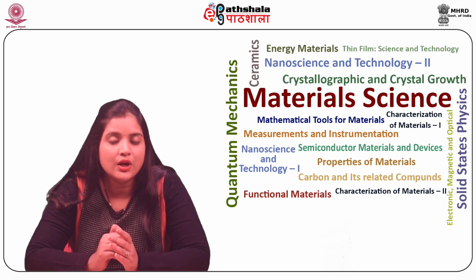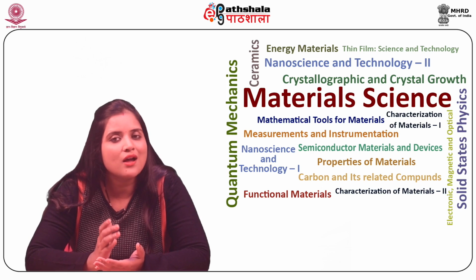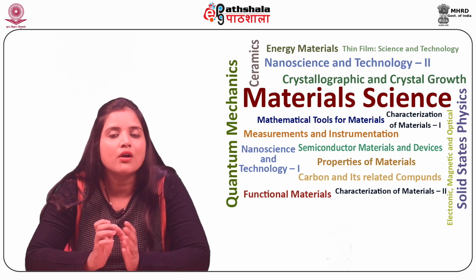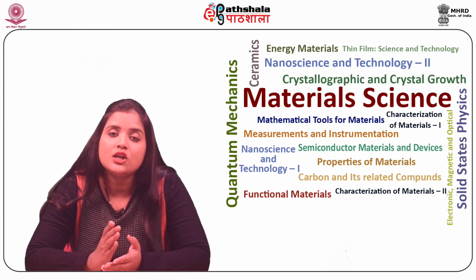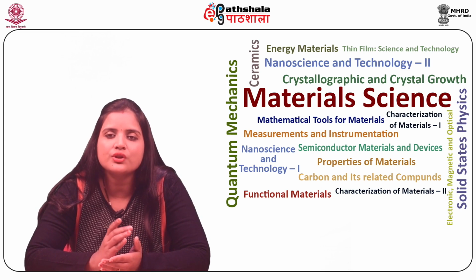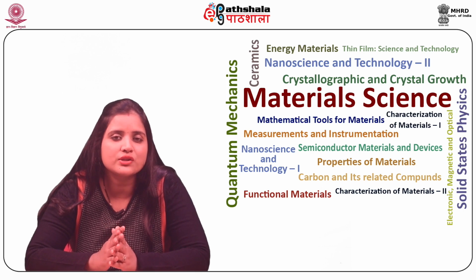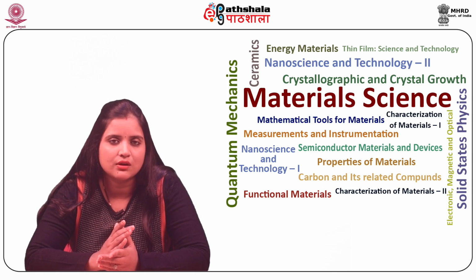Conventional holography involves creation of this field via optical methods and then recording by interferometric or other methods. However, digital holography comprises computation of associated fields and is highly complex, as three-dimensional features often comprise non-planar surfaces.